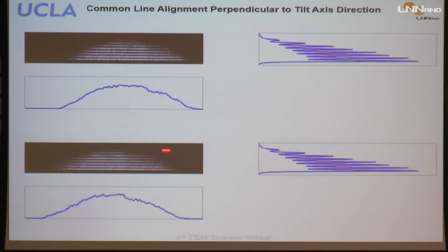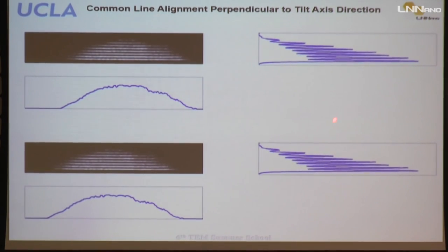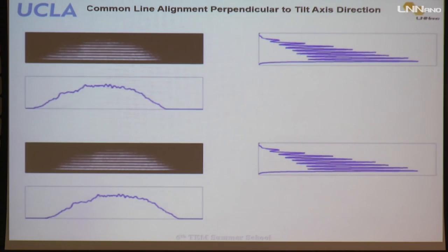But the problem is, this is after alignment, that's fine. But you don't have aligned data. You have to align your data to make either this or this; anyway, you have to make your projections rotate along one common axis. That's actually complicated because there are a lot of possibilities and they can be easily mixed up.